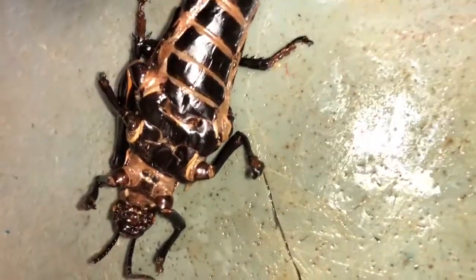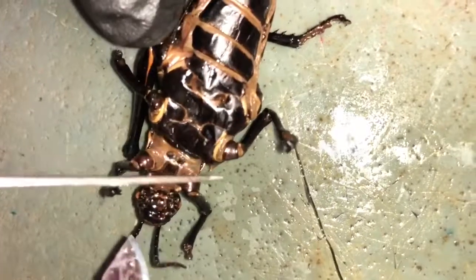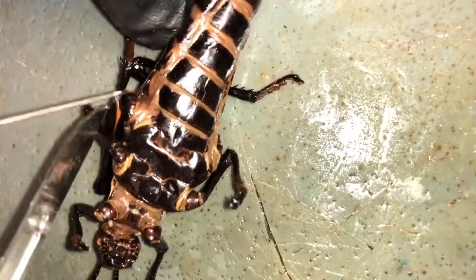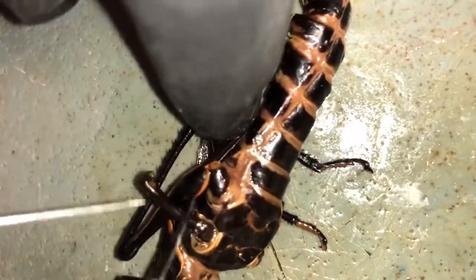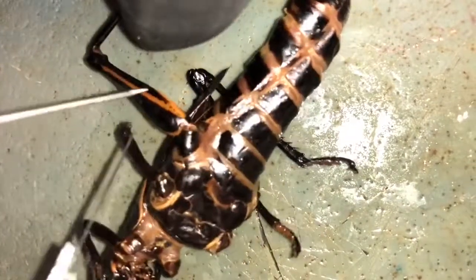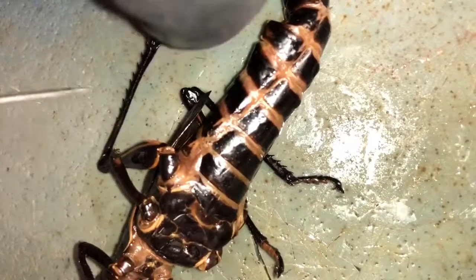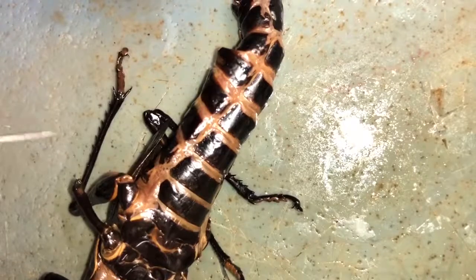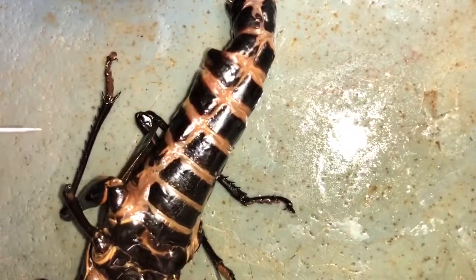Show me a coxa. Right here. Trochanter, right here. Femur. Here. And the femur's right here. Every leg has a femur. I'd like to use the big one. Tibia? Here. And then tarsi, sternum. That's all we can do on that.